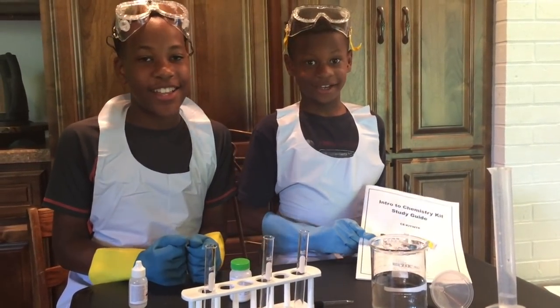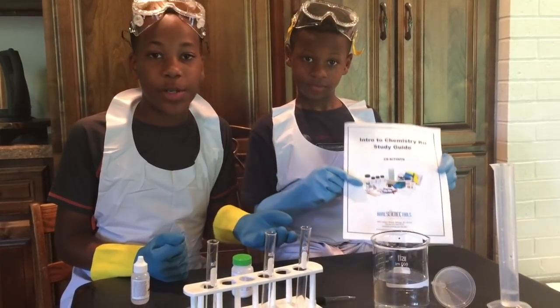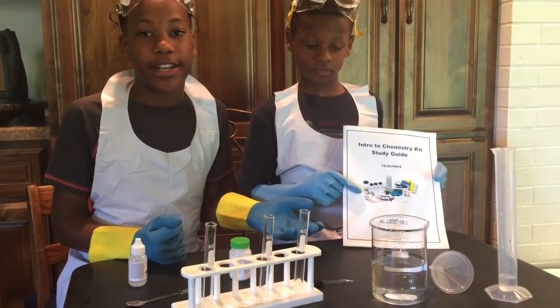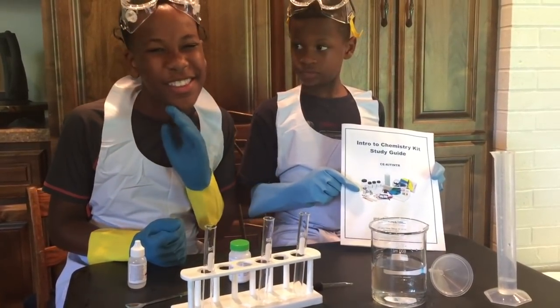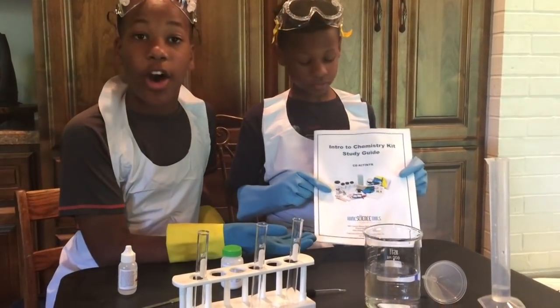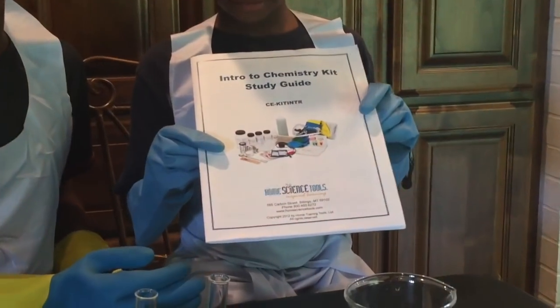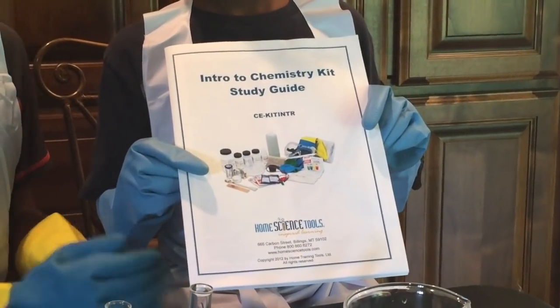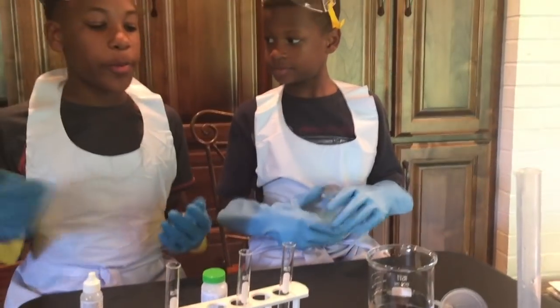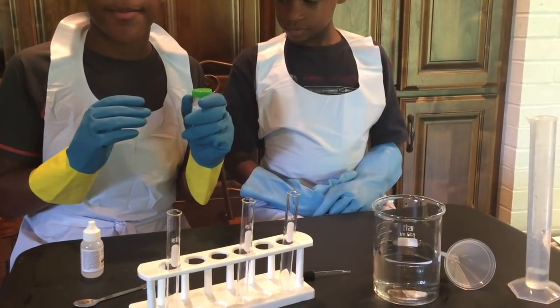Hi, I'm Josiah and I'm Jeremiah, and today we'll be showing you how to turn clear water to pink water and back to clear water again. Hint: this isn't really magic, it's just chemistry. All the instructions can be found in the Home Science Tools chemistry kit guide.